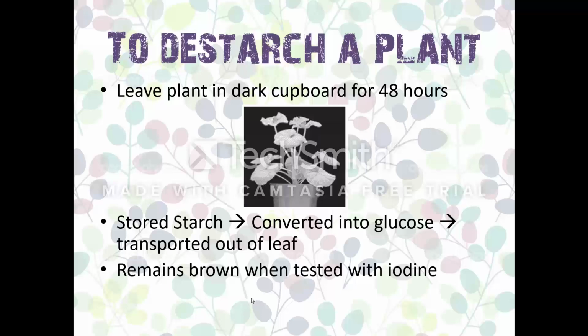Photosynthesis could have taken place because of carbon dioxide, or some person could have just lied to us and maybe we just believe it. So in order to prove anything, I must first take the starch out of a leaf and then expose that leaf to the conditions that I want to see if photosynthesis took place. Okay, so in other words, we're going to take a leaf from our garden, and we need to now first remove the starch from that plant.